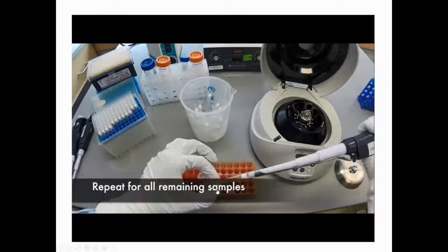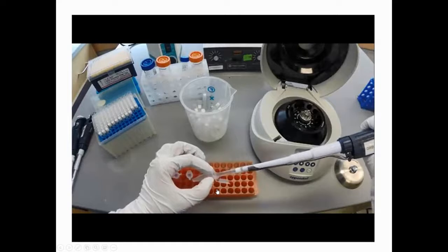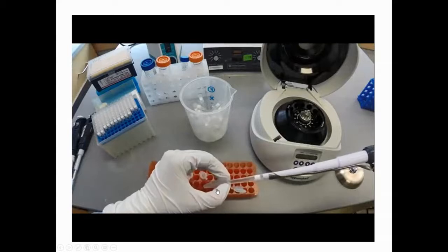The reason you don't need to remove all the supernatant is because in the next step, you can wash the pellet again, or you can air dry. Inspect the tube to see if the pellet is still present. If it has gone missing, make a note of that.